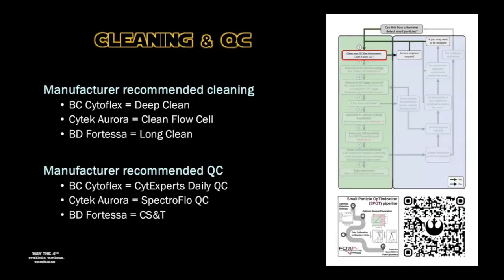Manufacturer recommended QCs for CytoFLEX, this would be your CytExpert Daily QC. Cytek Auroras would be your SpectroFlo QC. And of course, for your BD instruments, this is your CS&T.